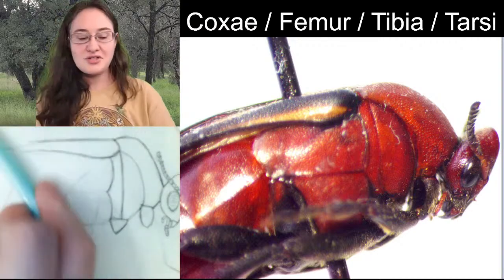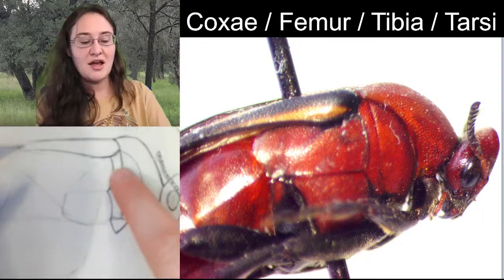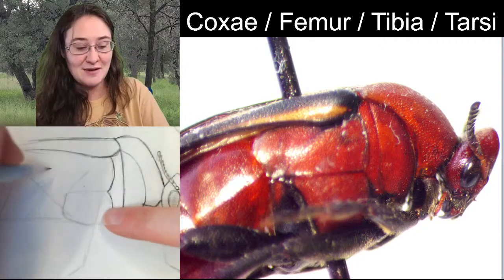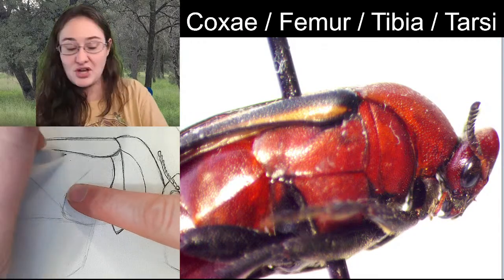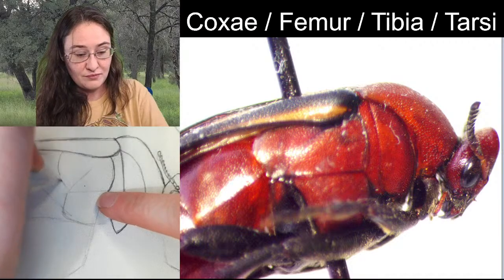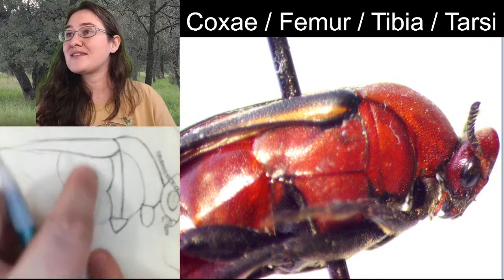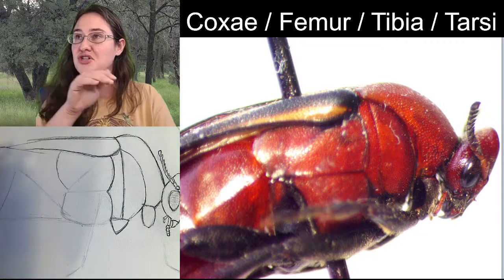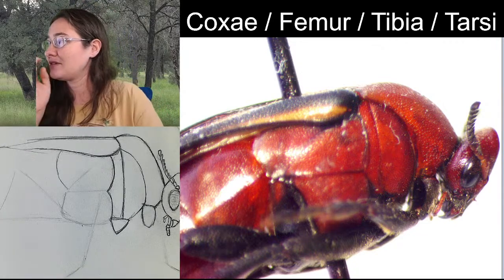All right, so something that we are noticing here, we have this triangle coming down, and that is a segment, but there is also a thoracic segment above this, too. Because you can see that wide arch now that we are looking at the glare.